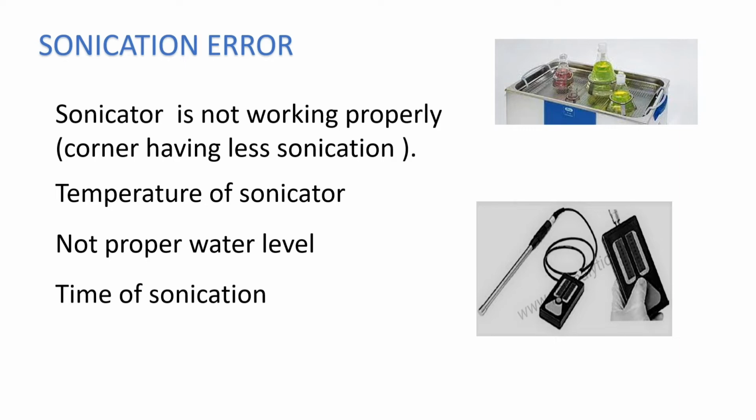This is first. Second, sometimes you are analyzing so many samples, like 3 BUs, that will be 30 volumetric flasks, and with standards around 34-35 volumetric flasks, sometimes 40. All the volumetric flasks cannot be put in the sonicator at a time due to space constraints. So in the test data sheet, if you have completed sonication of 10 volumetric flasks at a time, you can write those 10 flask numbers, done from this time to this time. The next 10 from this time to this time.